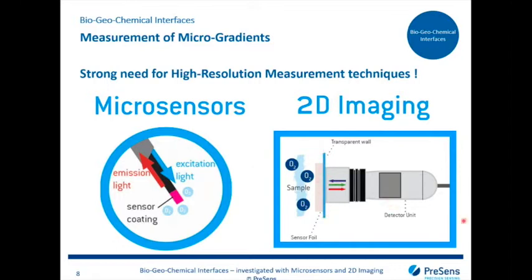What those two techniques have in common is that they can all be applied on live samples. They are even non-invasive or only micro-invasive. There is no need for fixation of the samples, meaning we can really study active biological systems without the need of killing or fixation of the sample.